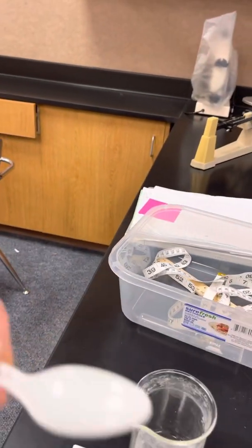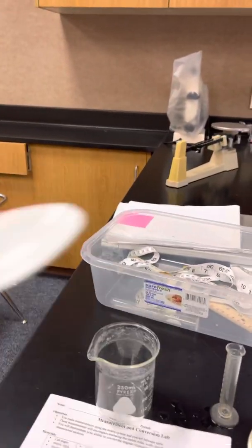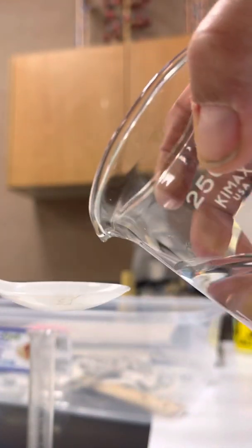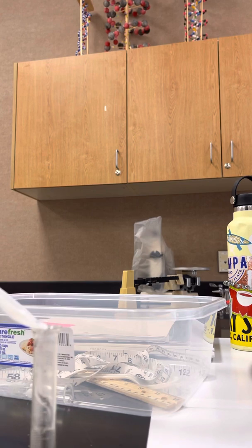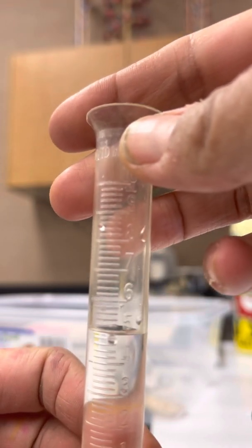So here's my plastic spoon. Let's see how much it holds. We're going to use a smaller cylinder. Again, this is a little tricky because I have to hold the camera at the same time. I'm going to try to prop this up. Okay, so put some water in here and pour it in this little graduated cylinder. Of course, I spilled some. Okay, let's look at how much we have there. I spilled some, so I'm going to say about 5 milliliters.